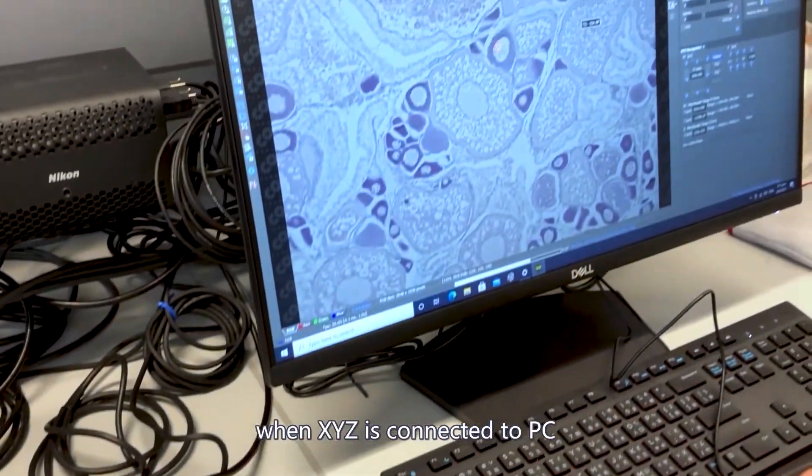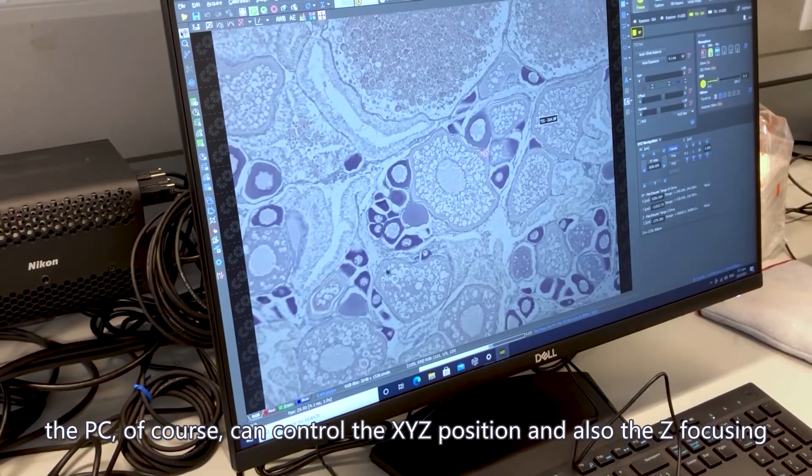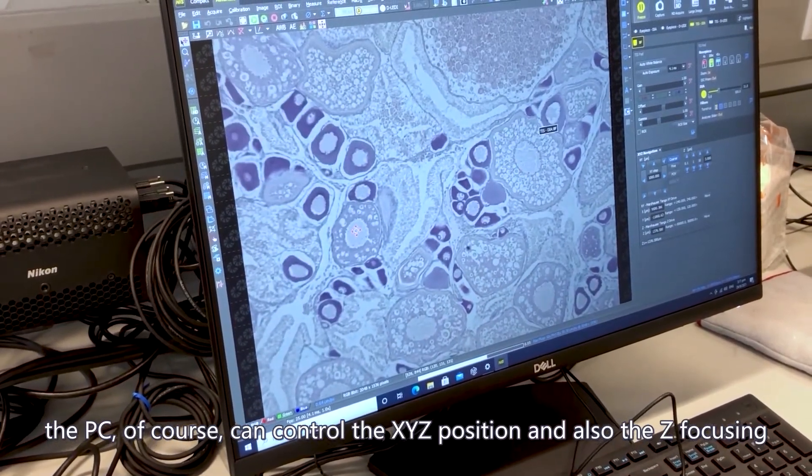When XYZ is connected to the PC, the PC can of course control XYZ position and also the Z focusing.